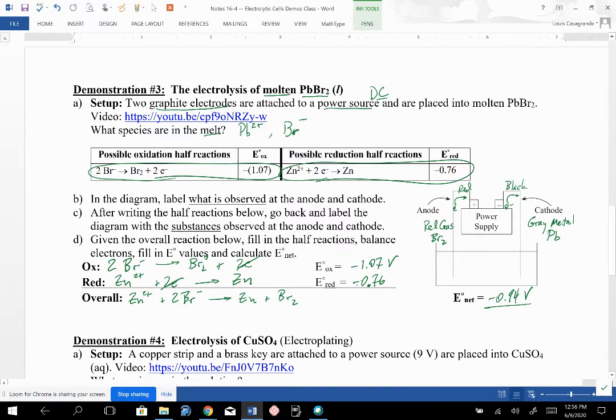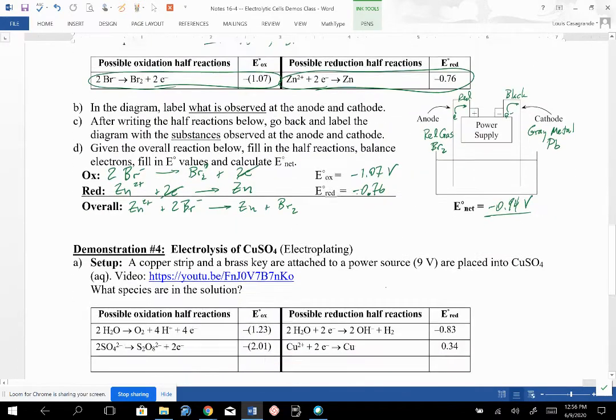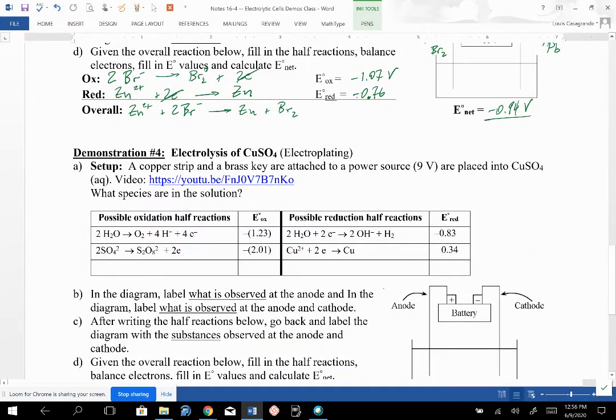Finally, another use for electrolysis is electroplating. Now, why would you want to electroplate something? Well, electroplating is how you make things like gold-plated jewelry or silver-plated jewelry. It takes a base metal, something like iron or nickel, something that's not worth as much, and it puts a nice shiny, prettier and more expensive looking coating on it. This is how you would make some gold plating.